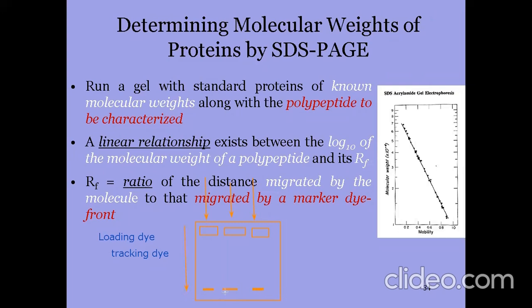The electrophoresis has been done more than half, and if we apply more current, it will go out of the gel. We don't need our bands to go out of the gel, so we will stop the current, take the gel to visualize, and then scan it. Am I clear?